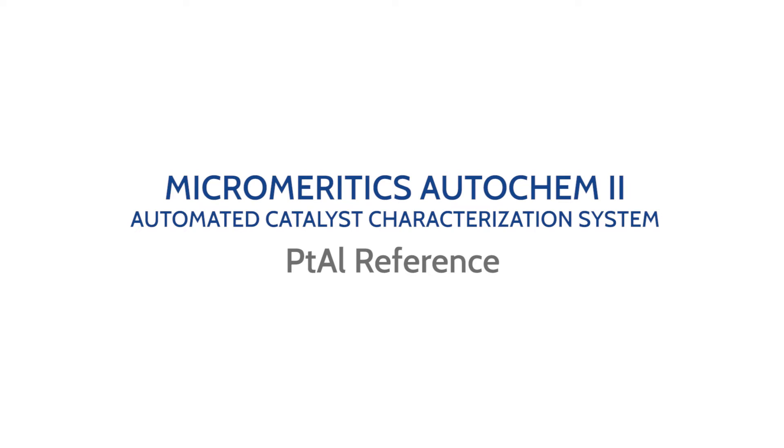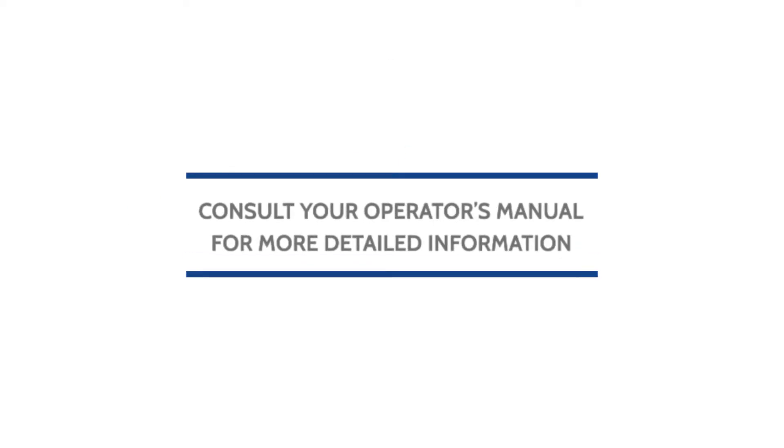This video will show how to run a carbon monoxide pulse chemisorption analysis with the platinum alumina reference material on the MicroMeritics AutoChem 2 automated catalyst characterization system. Remember to always consult your operator's manual for more detailed information.